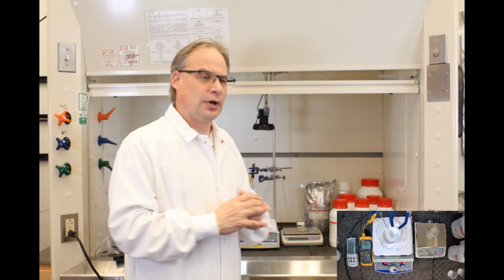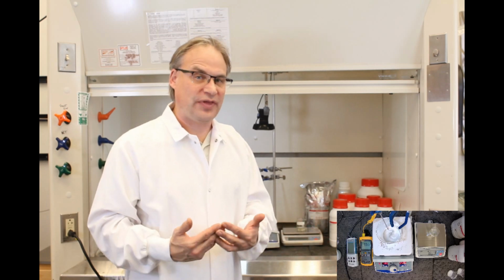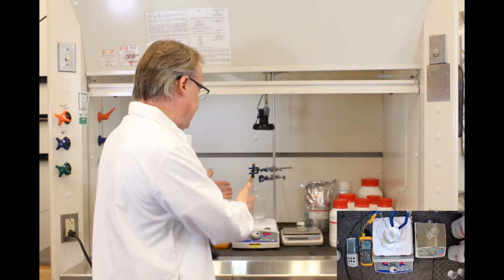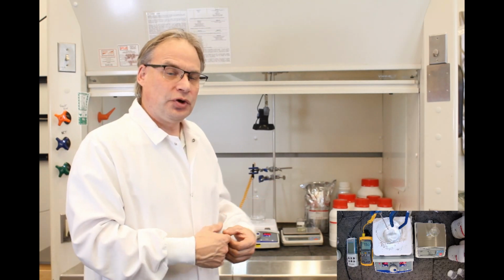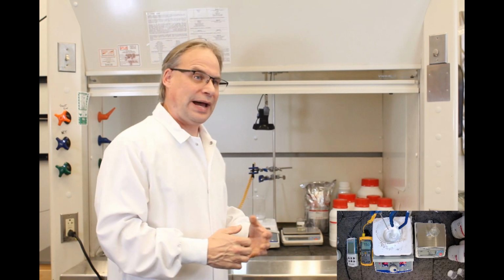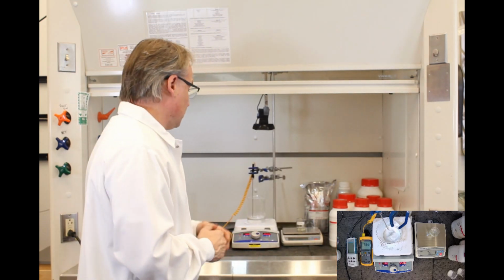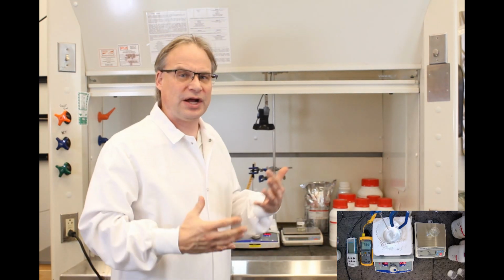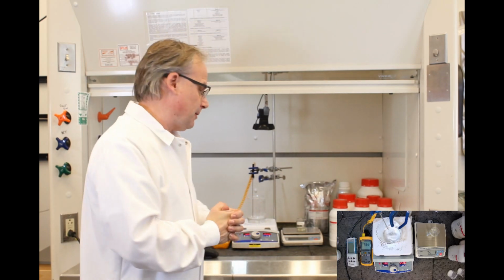As usual with chemical reactions, some of these are endothermic and some of them are exothermic. What that means is some of these reactions need heat to occur, so they need energy in order to bond. Others release energy, so we may have to cool them. So some of these salts that we'll make will actually have to be chilled or cooled so that they don't go out of control and the nicotine just doesn't boil off. In this case here, we're dealing with a reaction that really doesn't matter, so we can just preheat it to speed the reaction up.